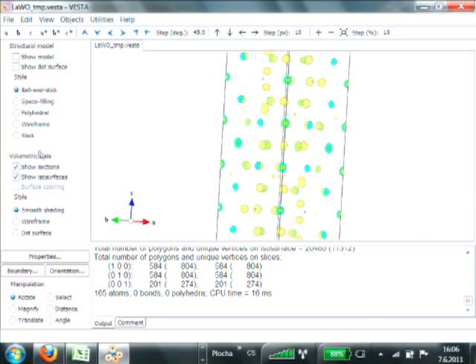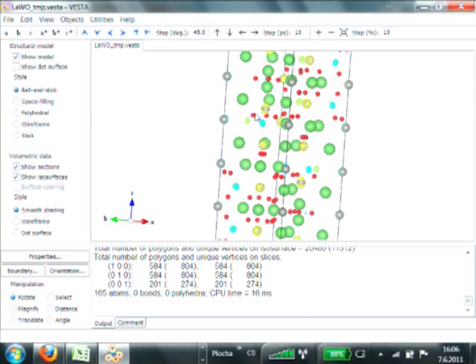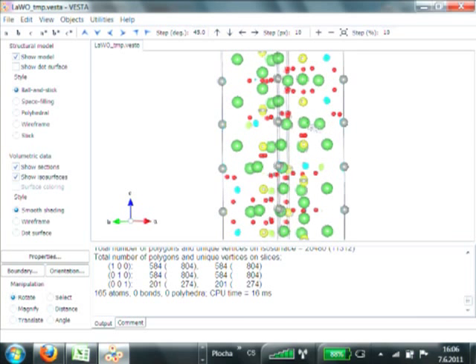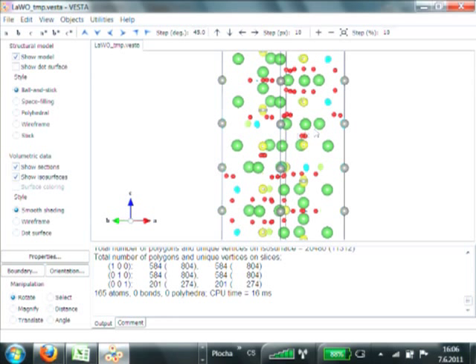If we concentrate on the oxygens, we see that there is a couple of them. For example, these 3 here, they coordinate a tungsten atom, so they are most probably correct. Some of them are missing, and there is a couple that are false. And these are, how much time do I have? No time anymore.